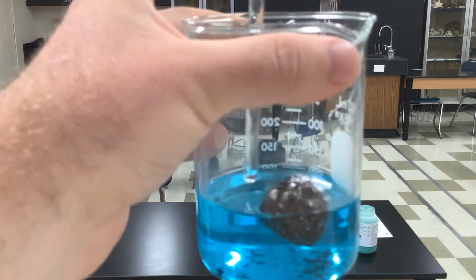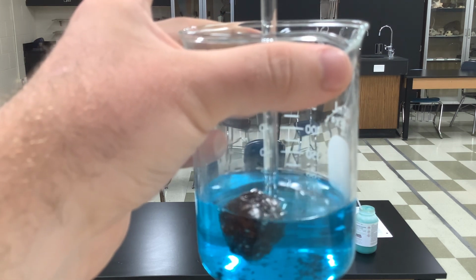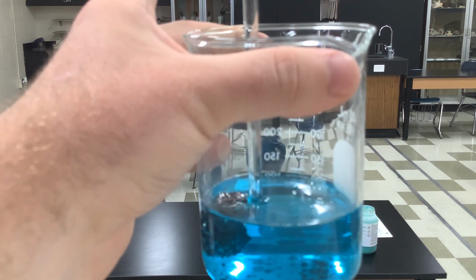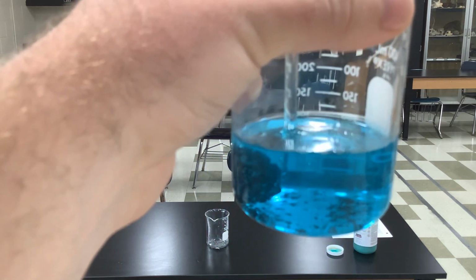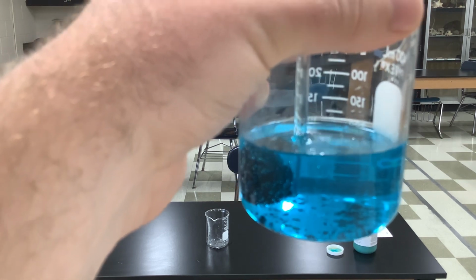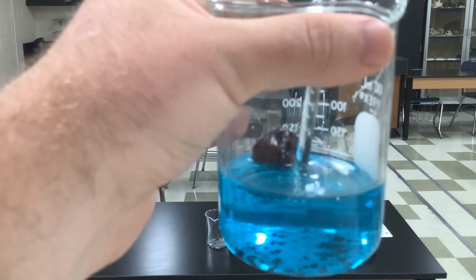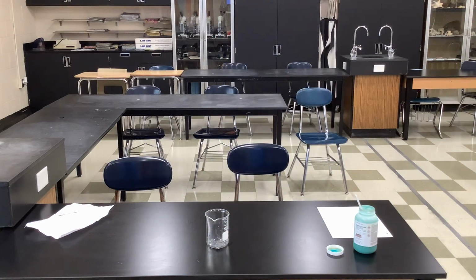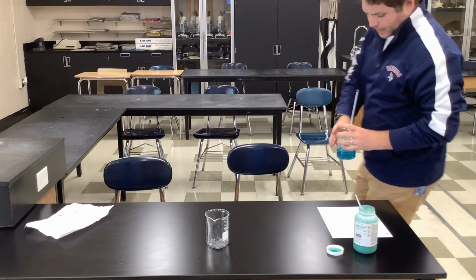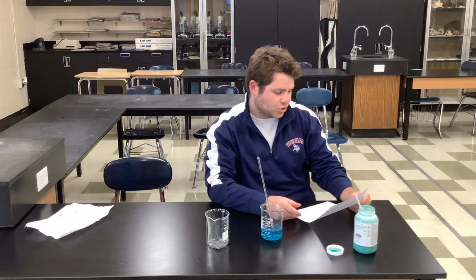Now you could really start to see all the brown. You see all the bubbles fizzing off of it. You see that? And you see it really is starting to change shape, change color. Okay, so you'll tell me what type of change is going on. All right? So once you've done the lab, there are some questions on the back. There's 6 questions for you to answer. And yeah, I hope you guys enjoy it.